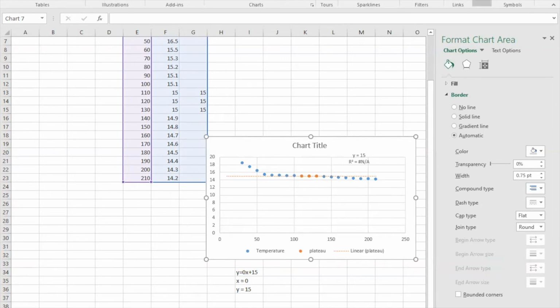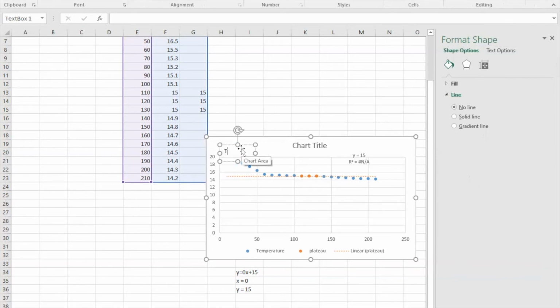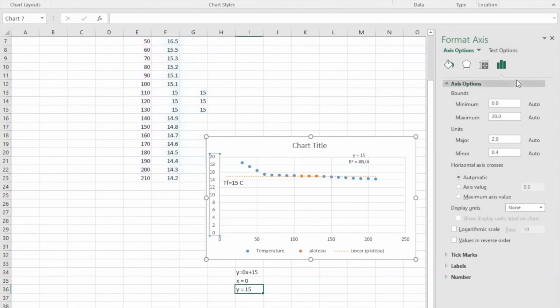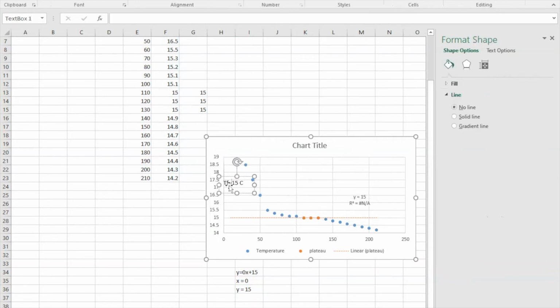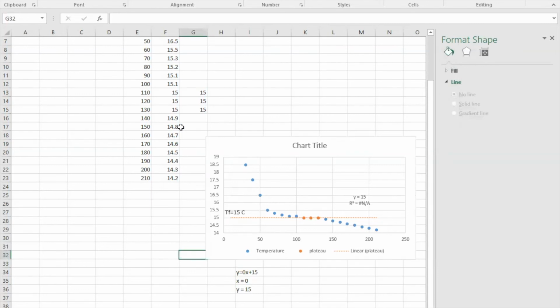And yeah, so there's a way to insert text and all that. If you wanted to, you could put a little text box on here, and you could write 15C, and you could bring that down to the label there. The graph doesn't look too good, so let me change that really quick. So to label your data for easy grading and so on, you could insert a text box and write TF is equal to 15 degrees Celsius. And that's where the intercept is, okay?